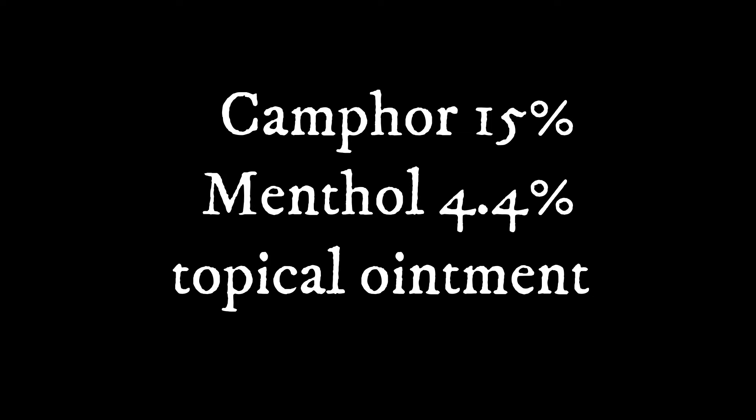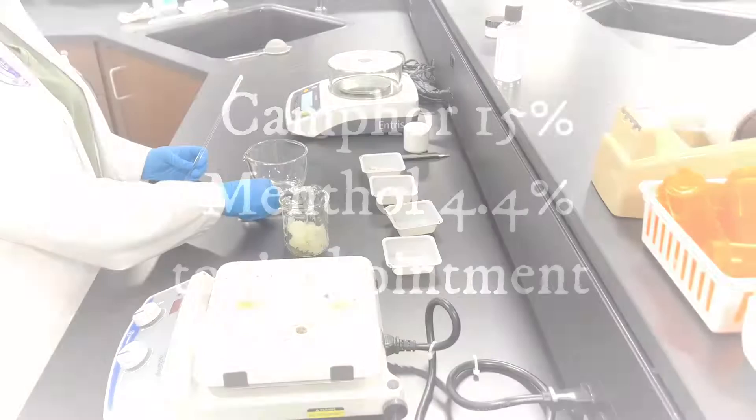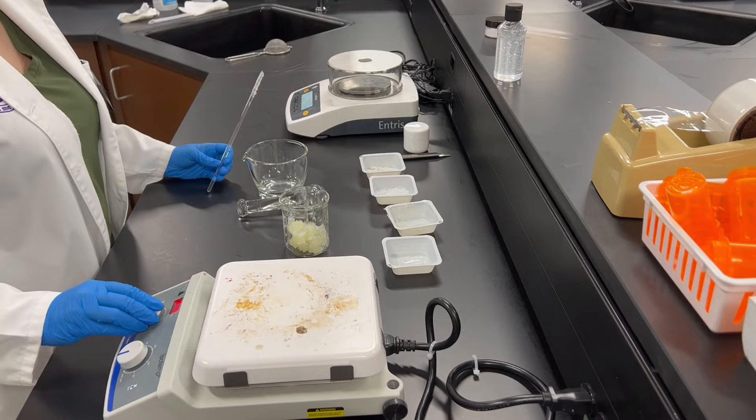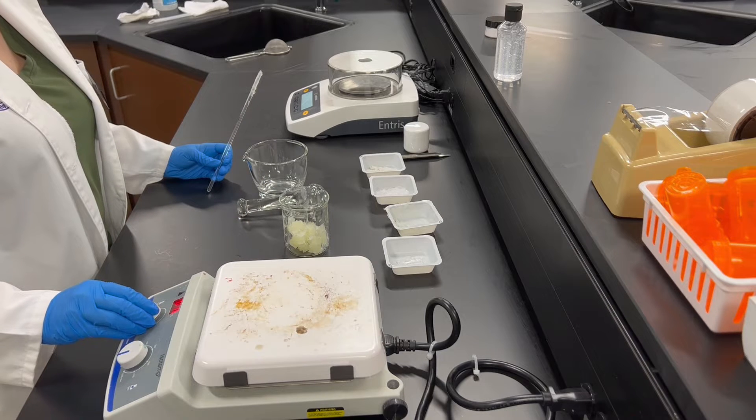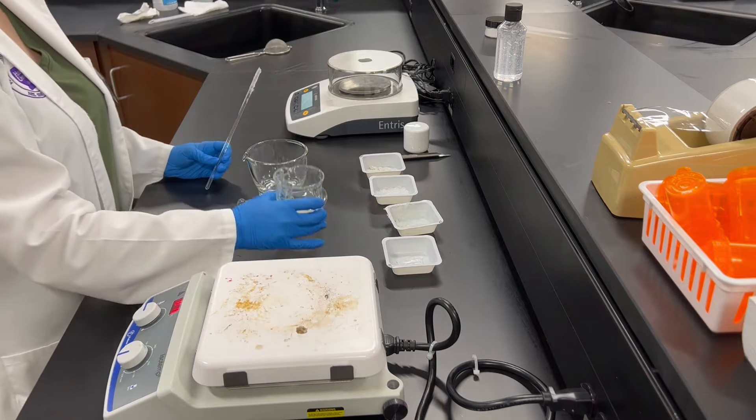Today you're going to be making camphor 15% menthol 4.4% topical ointment. The first thing you want to do is go ahead and weigh out all of your ingredients, and you can also go ahead and weigh your empty ointment jar as well.